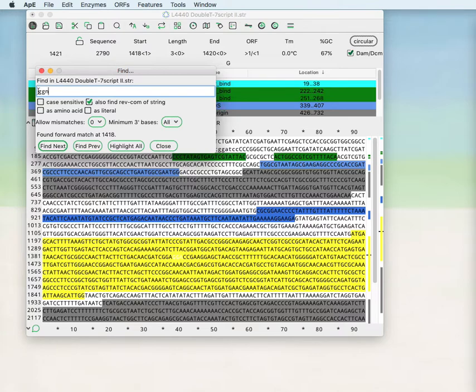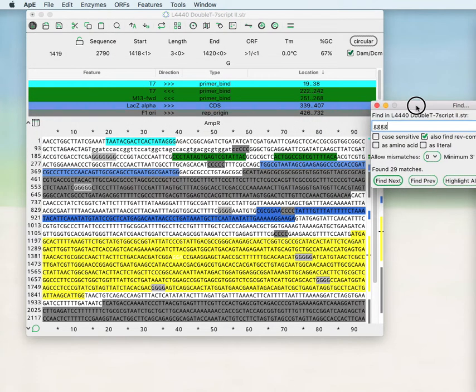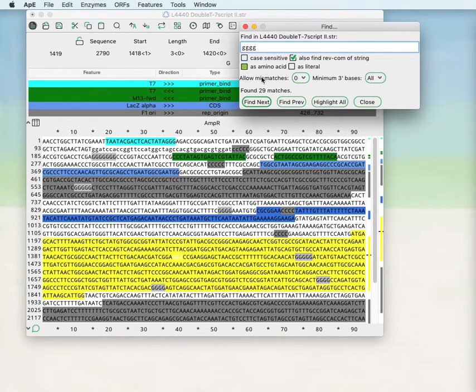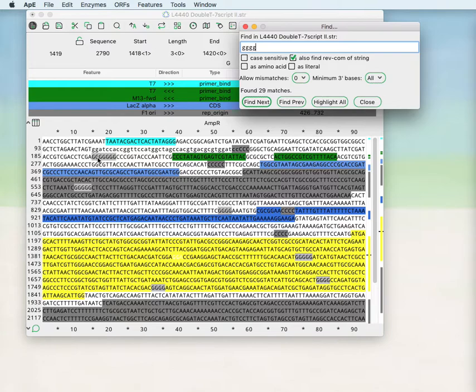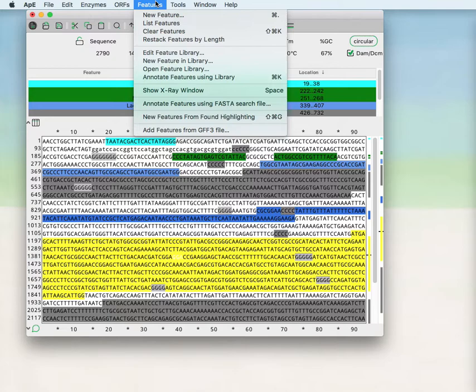So in this case it would match two g's followed by any base. You can also highlight all of the regions that match the search parameters and it will highlight in light gray the forward matches and in dark gray the reverse matches. You can then take those and make new features out of the find highlighting if you would like.